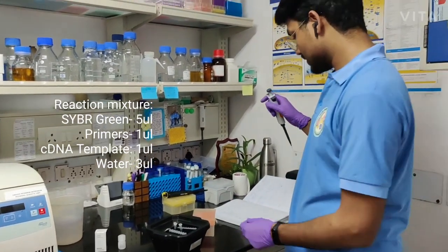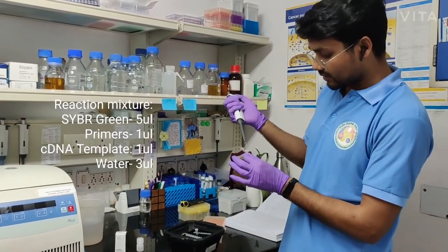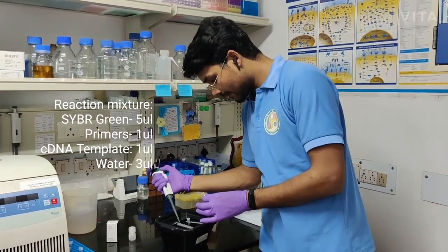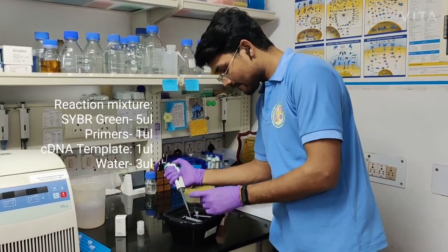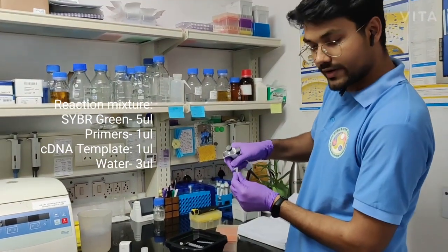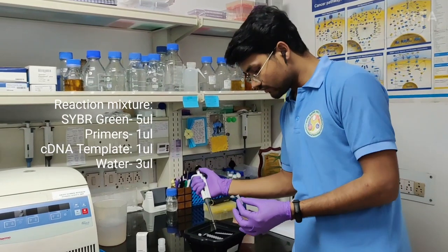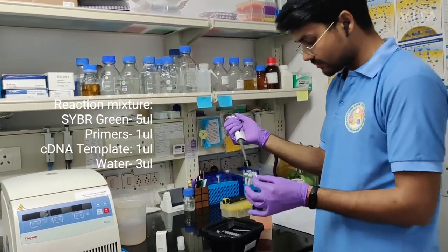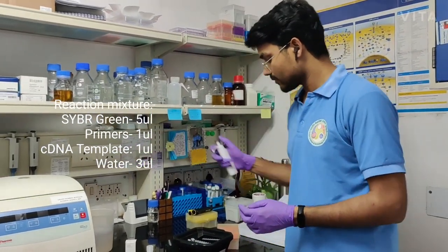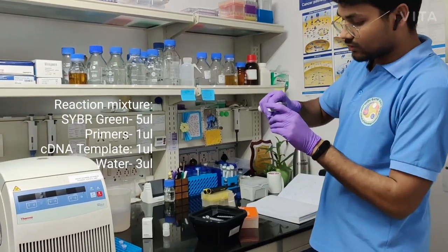Now 5 microliter of SYBR Green, and 1 microliter of each primer. So I'm going to use 1 microliter of primer in each tube. This is GAPDH. This is a virus primer. So I'm going to compare the amplification of viral RNA with the internal control GAPDH. This is the primer, 1 microliter of primer. We'll add 3 microliter of water to make the whole reaction up to 9 microliter.